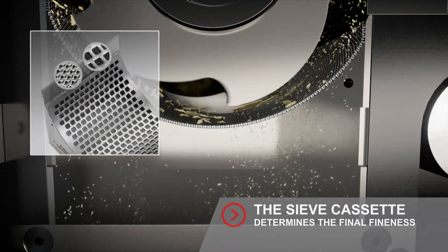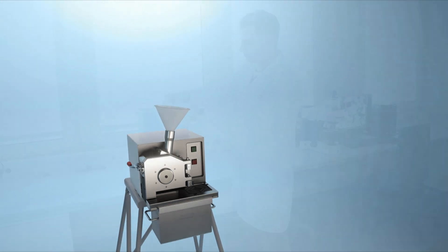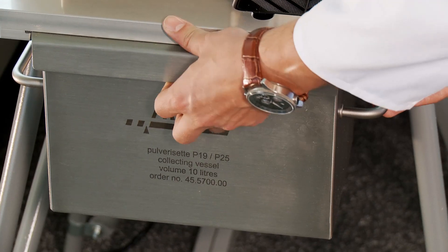Fritsch sieve cassettes guarantee the constant distance between rotor and sample material, and always ensure an ideal result.